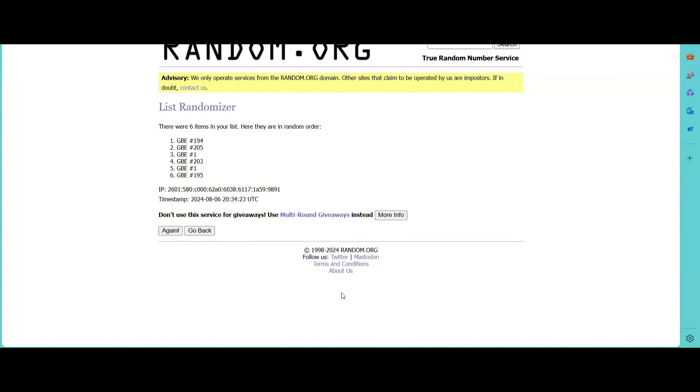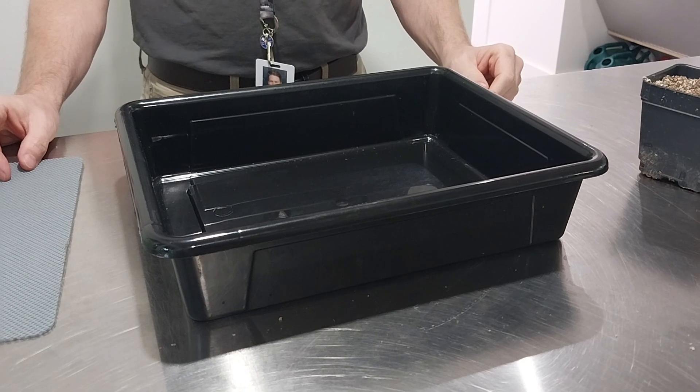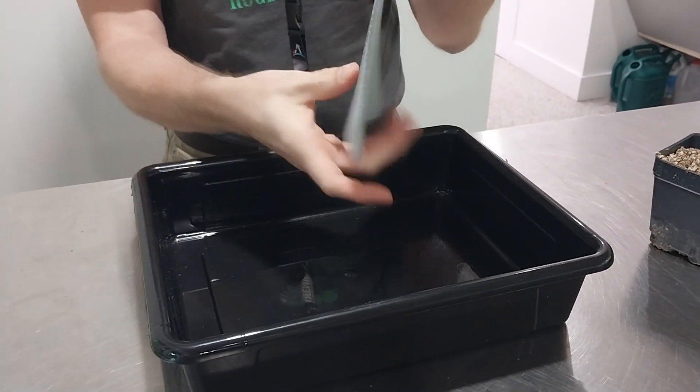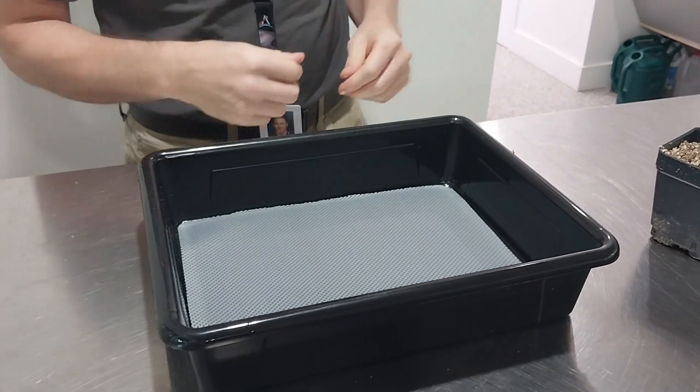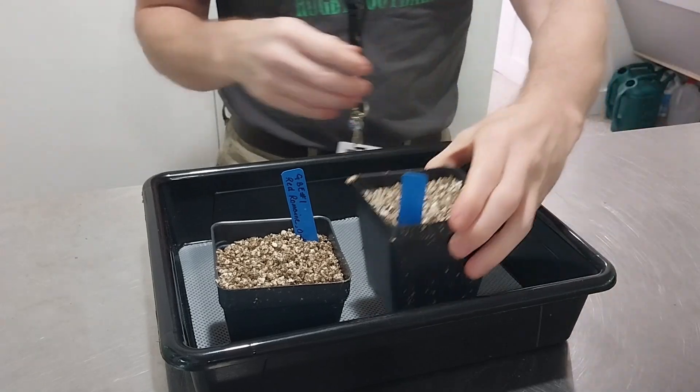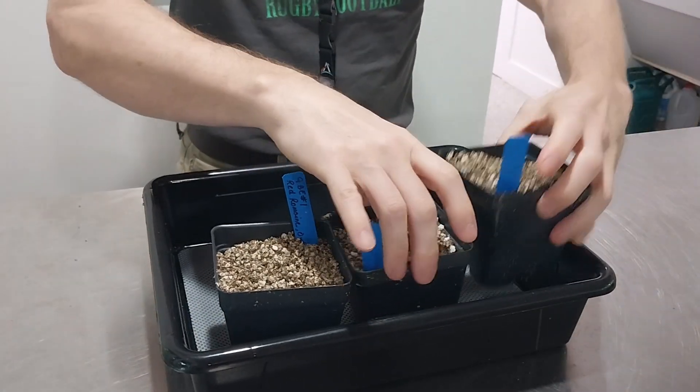Use the numbers 1 through 3 for pots A1 to A3, and 4 through 6 for pots B1 to B3. To set up the watering tray, place the wicking mat at the bottom of the tray. Once this is in, begin to set up the pots in the same order that the randomizer gave.